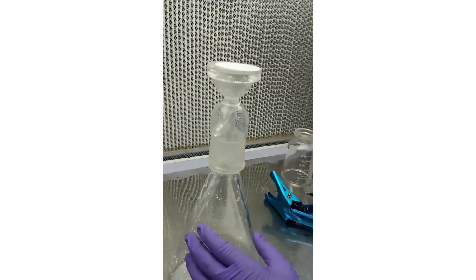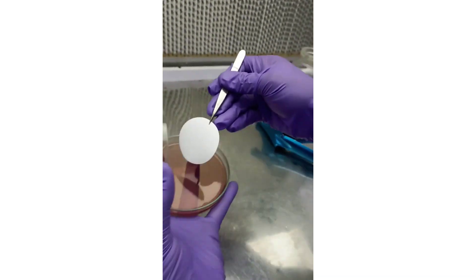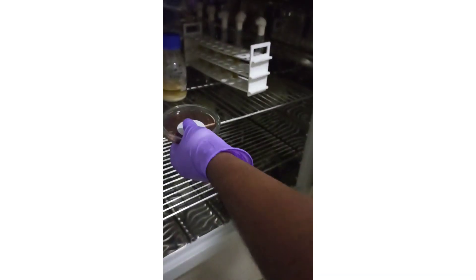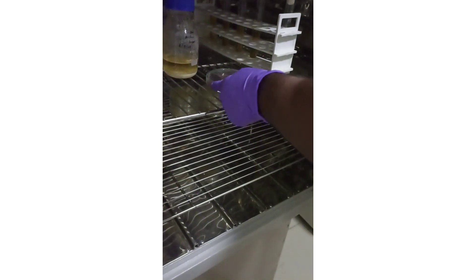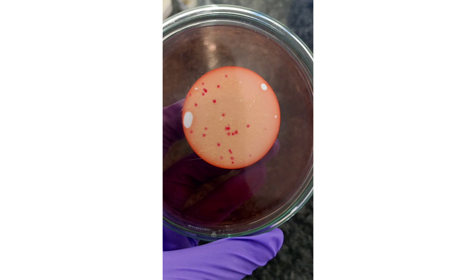With the help of forceps, remove the filter paper and place it on the VRB agar media plate evenly. Incubate at 37 degrees Celsius for 24 hours. Count the number of colonies obtained on the filter paper and report the results.